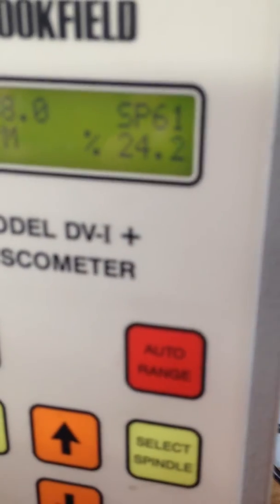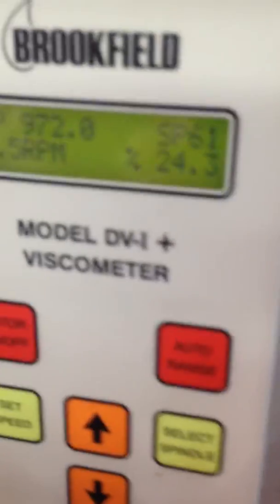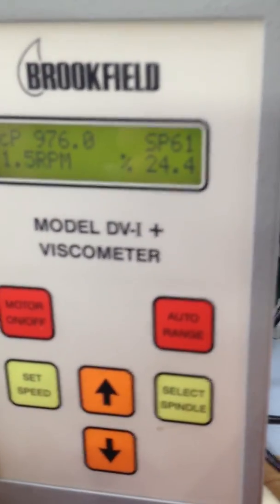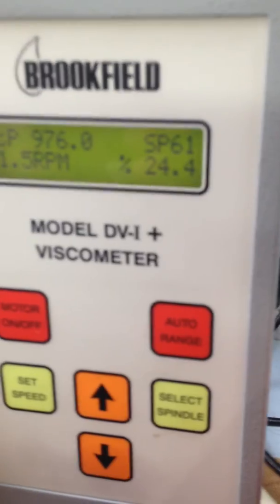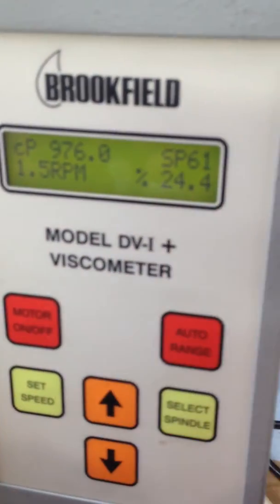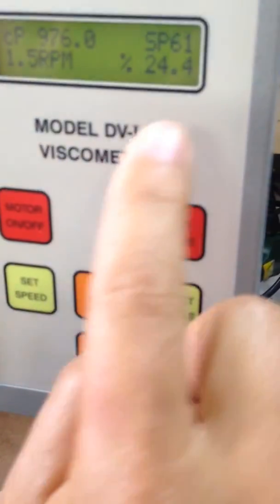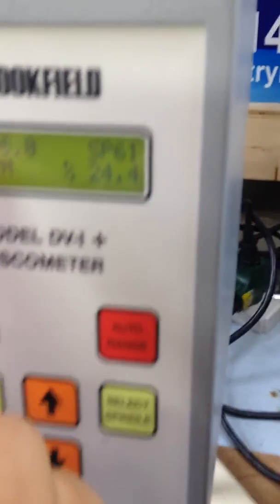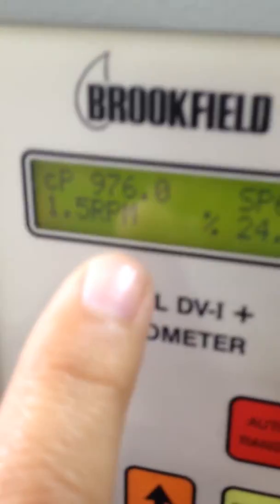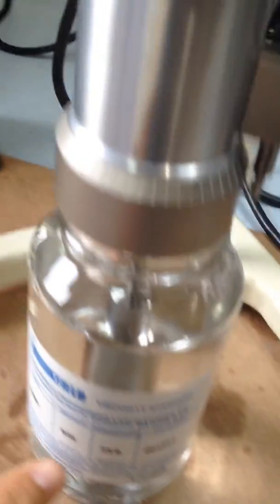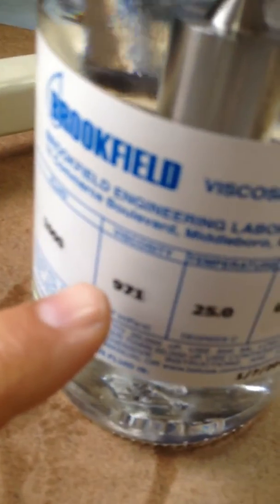I set this up for you so if you do have a 2000 or 3000 centipoise you'll be covering your range. Right now this is the lower end. 976 is your answer and the viscosity standard is actually 971.